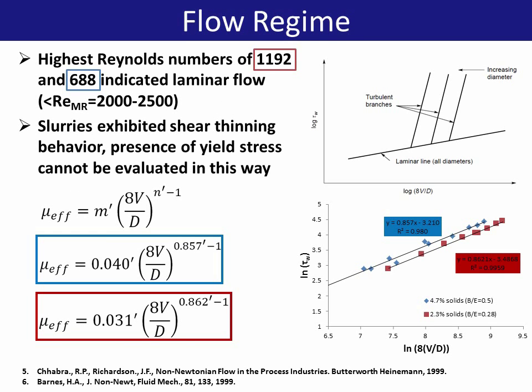This analysis indicated that the highest generalized Reynolds numbers obtained were well below the consensus values for the onset of turbulence. This was surprising given the fact that the standard pipe flow Reynolds numbers were as high as 10,000 for the experimental runs. Also, the presence of fine particulates seemed to induce effective shear thinning behavior in the two-phase flow. This analysis can be used directly for scale-up calculations. However, great care should be taken as it assumes time-independent behavior with respect to pressure drop, which, although true for this crystallization, may be violated by the progression of others.